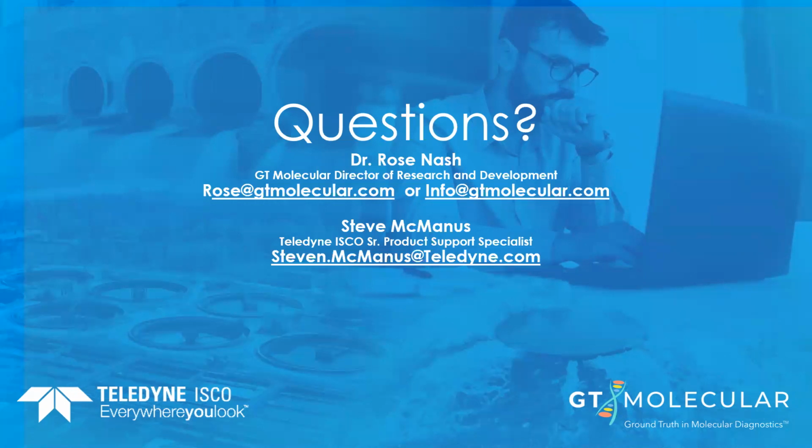Thank you, Dr. Nash. The next question relates to what additional hardware do I require to flow pace the samplers? Well, the obvious answer for that begins with you need some device that is able to measure the flow and provide flow-based and specifically volume-based detail to the sampler.